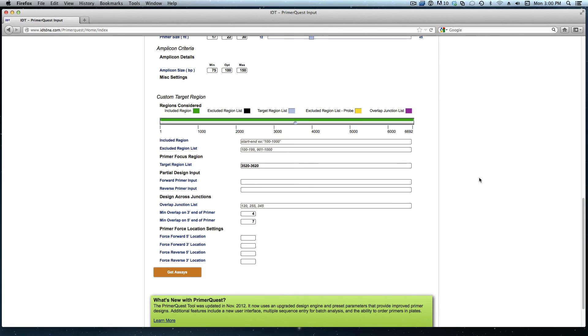I don't need to change any of the other design parameters so at this point I'll click get assays.